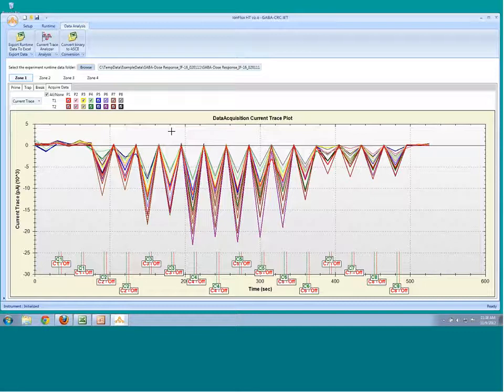But I also might want to take the individual sweeps that were underneath and take this entire data set, and instead of doing my data analysis within our software, simply convert all of the data to a form that can be read by other software packages. One example of this would be the GeneData software. And so to do a global conversion of the entire experiment, we have a button here for simply converting everything that was collected during the experiment in one shot.